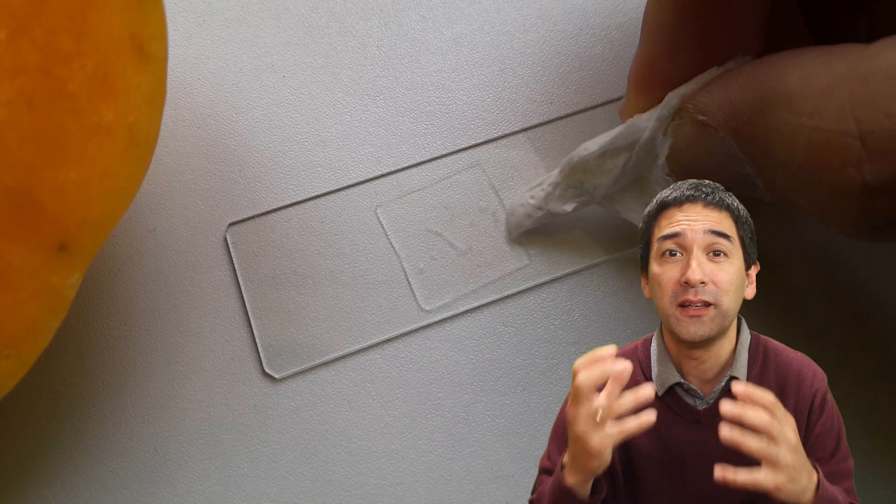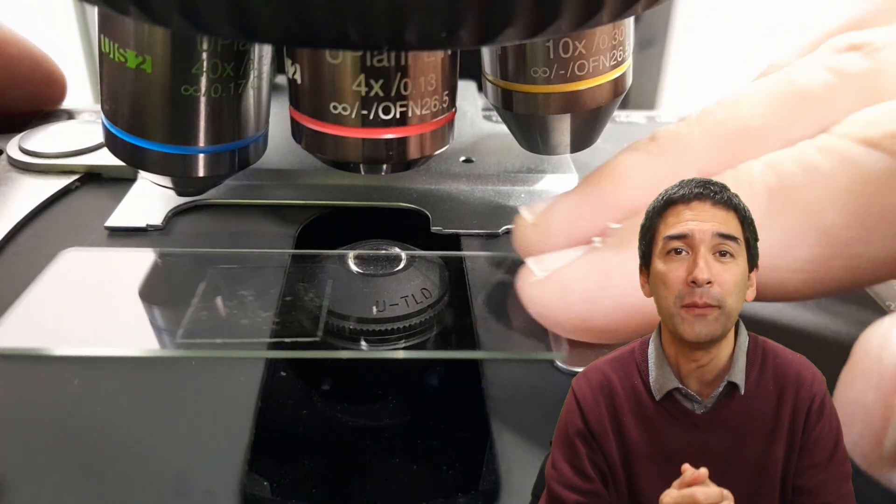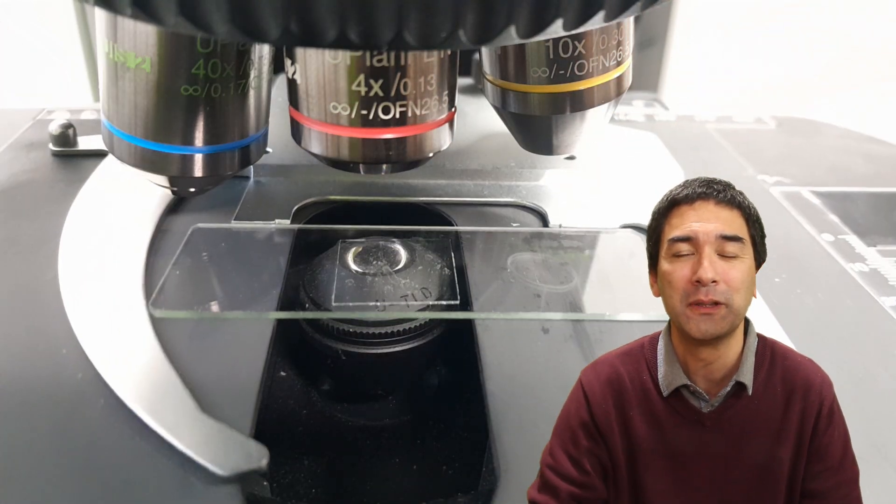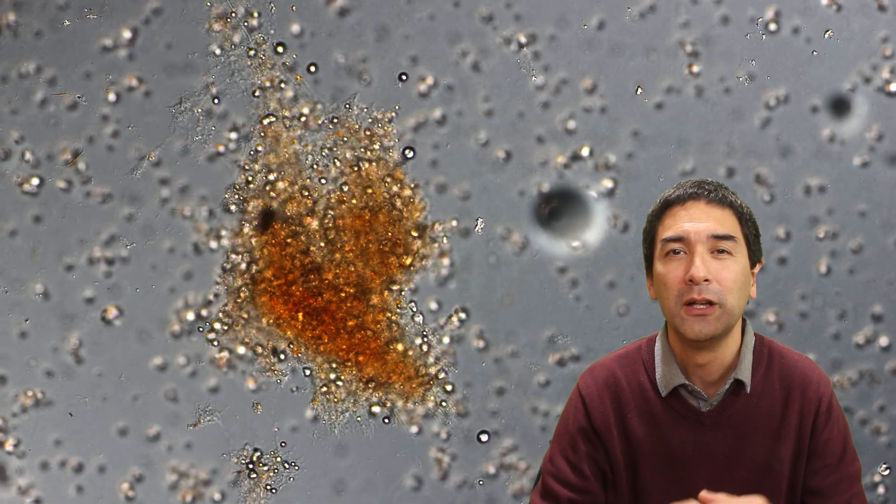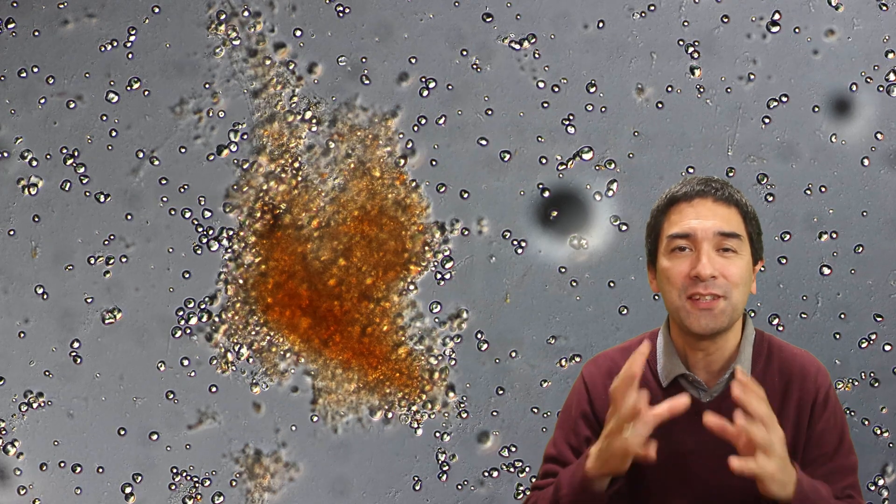This is now my microscope. Everything goes on the stage of the microscope, and then I had to really go up with the magnification quite a bit. I also had to turn up the light, and look, this is what I found. Look at this: thousands and thousands of those tiny little dots.